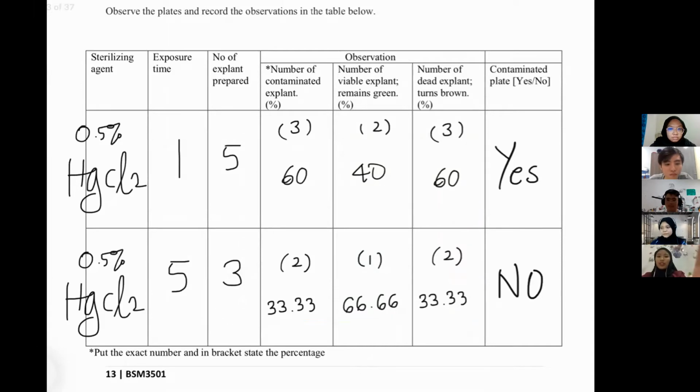our task, we need to use the mercury sterilizing agent, 0.5%. The exposure time here is 1 and 5 minutes. And for the number of explant, I put 5 on 1 minute. And here is the result. So the number of contaminated explant, I put 3, and the number of viable explant, I put 2. So the percentage that I got is 60% and 40%.